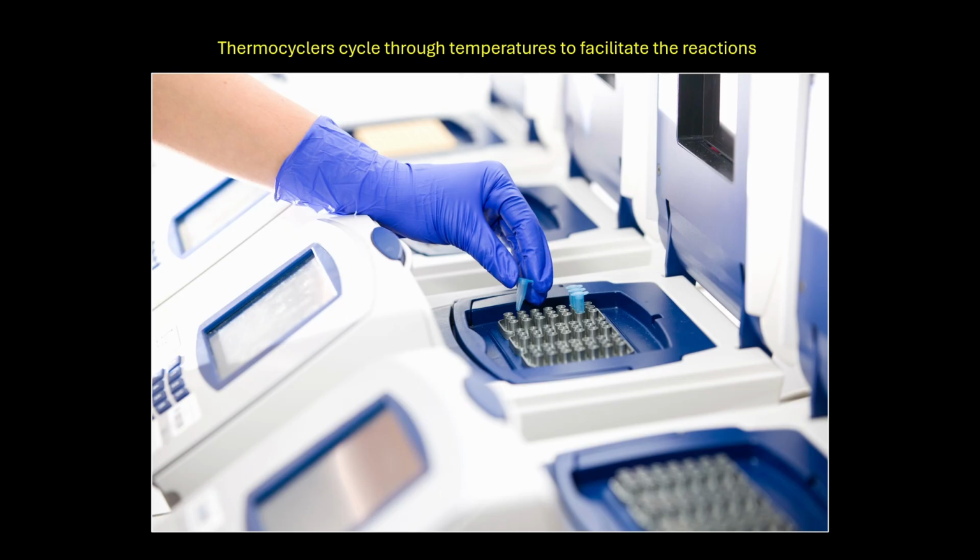Way back when, this used to be somebody's specific job. If you were doing this research, you would be carefully watching over your samples for almost an entire day continuously and modifying these temperatures yourself. But today we have really cool machines called thermocyclers that can cycle through these different temperatures all on their own and facilitate this process. Now, today, the process takes maybe 4 hours.